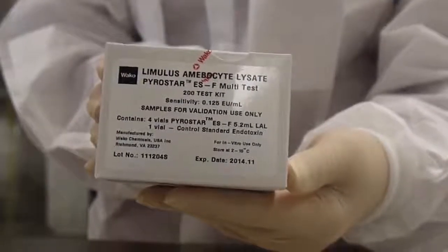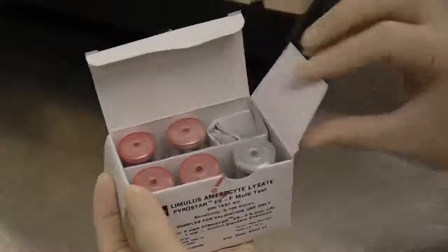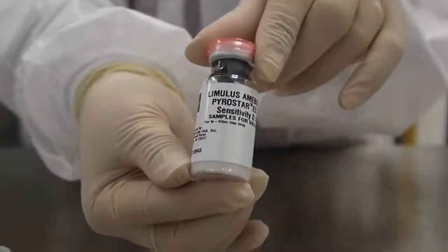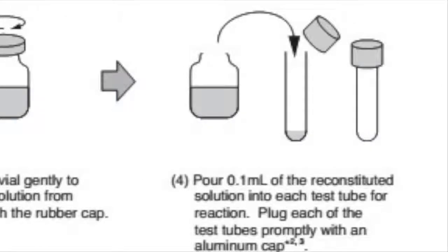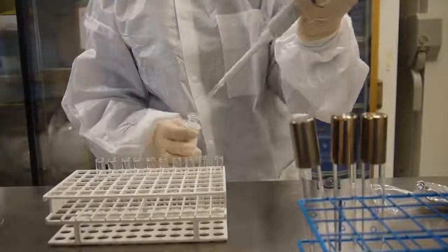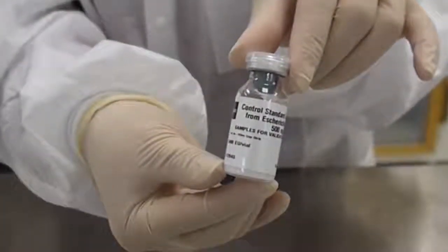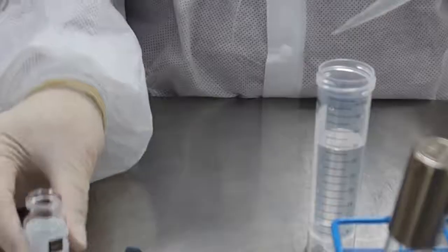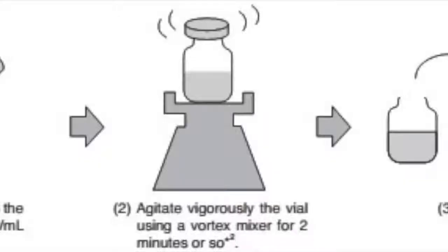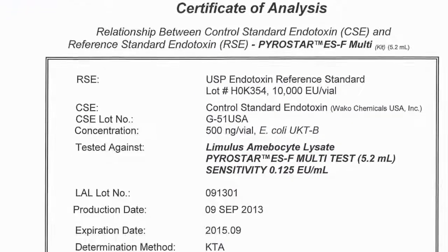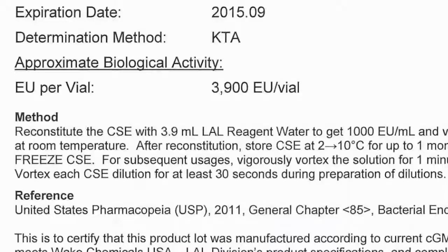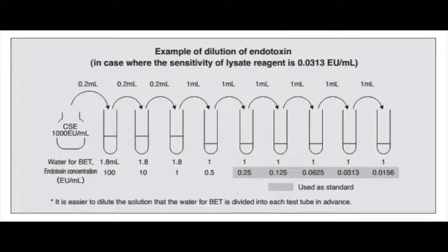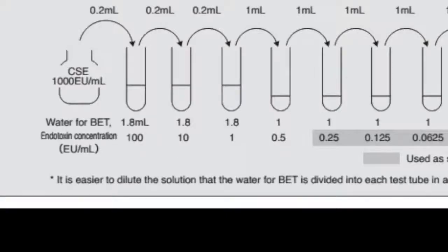Upon opening our multi-test kit, you will find four vials of ESF and one vial of CSE. You will now reconstitute the reagent and place 0.1 MLS into each reaction tube. We will now reconstitute our CSE to prepare our standard dilutions. We must first add to our CSE the correct amount of lysate reagent water to make 1,000 EU per ml concentration. The amount of reagent water necessary to reach this concentration can be found within the CFA for the matching kit. We show here an example for diluting endotoxins, but in this particular test, we will only dilute to 0.0625 concentration.